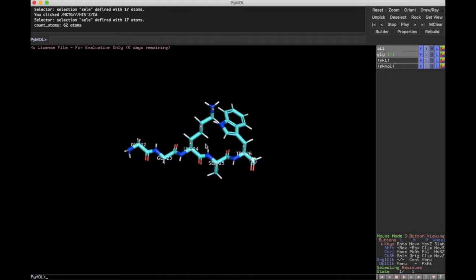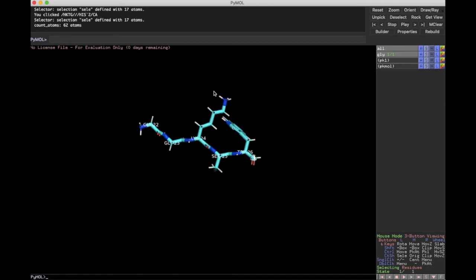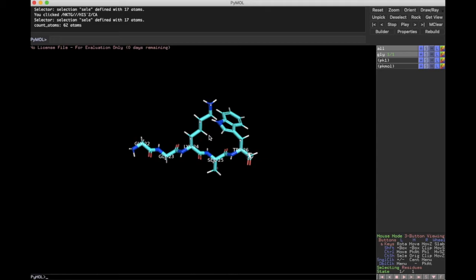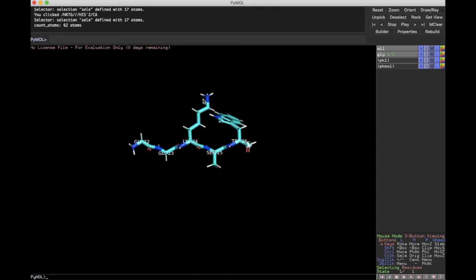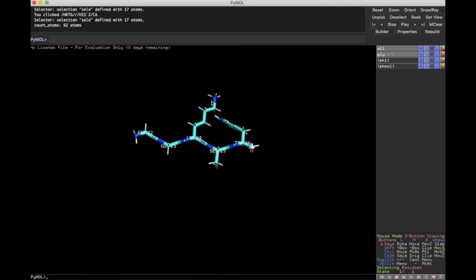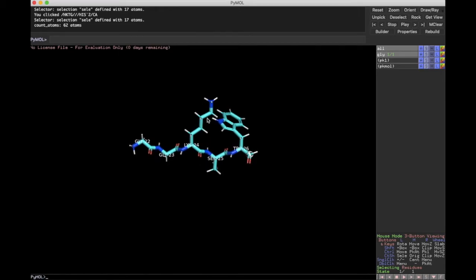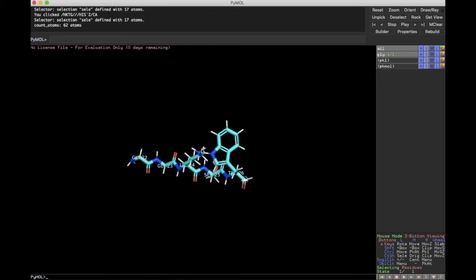Okay. All right. So now maybe let's go ahead and sculpt it, because when we do add this into our other protein, or tag it onto that protein, then it's nice to start with a structure that is somewhat realistic.